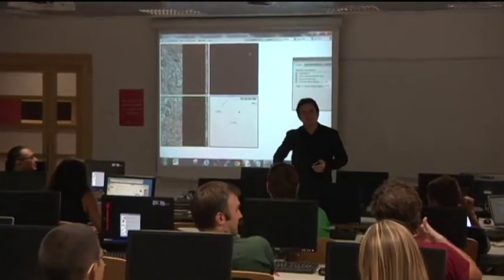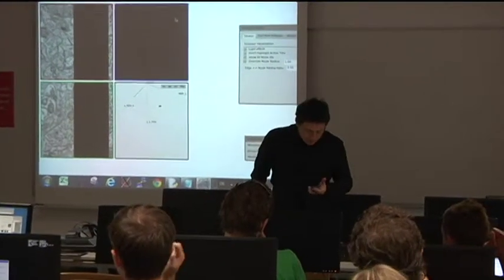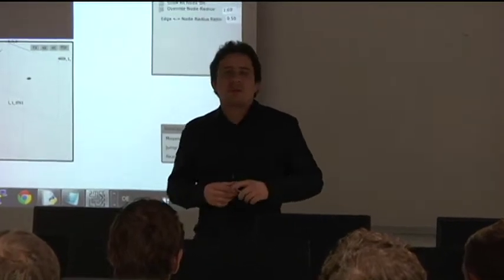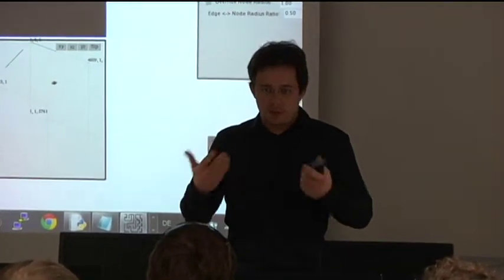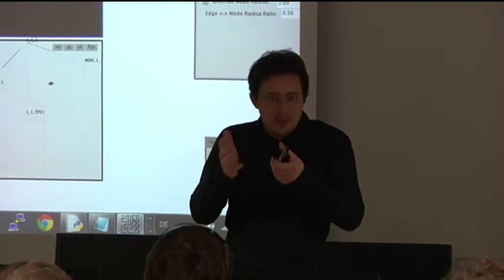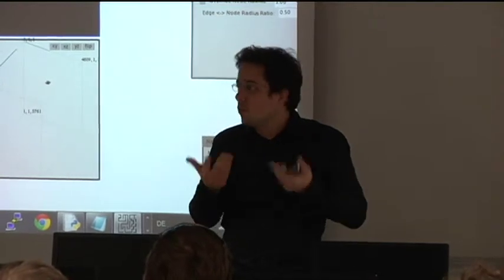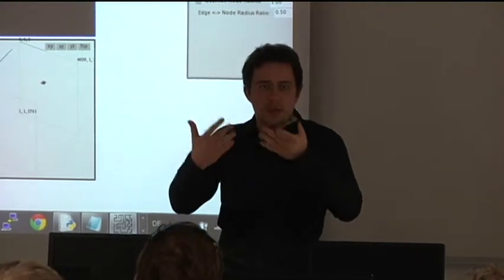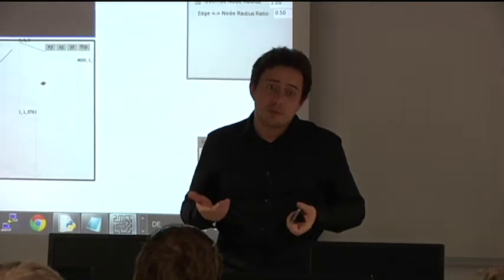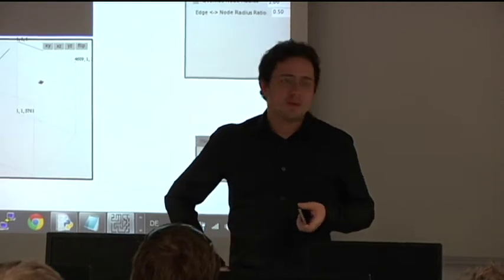Is there any approach to use it as a video game, like they did for protein folding and stuff like that, and put it online? Yeah, so this is exactly what my group is working on right now. We're building a browser-based game around this, because out of this experience, first of all, you can turn it into kind of fun, at least a competition, and that always helps. And secondly, it's so intuitive if you put the data in the right way and if you tell people the right things. So yeah, we're doing that right now. The hope is really to scale up that kind of annotation by some orders of magnitude.